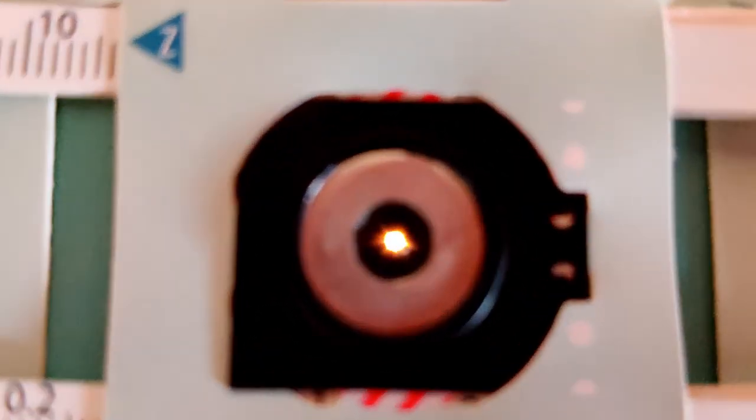Observe the arrangement of the cells and the structure of the cell walls of the onion peel.